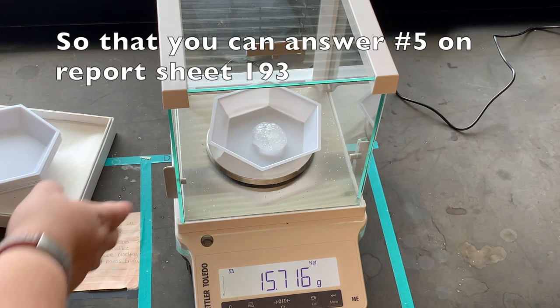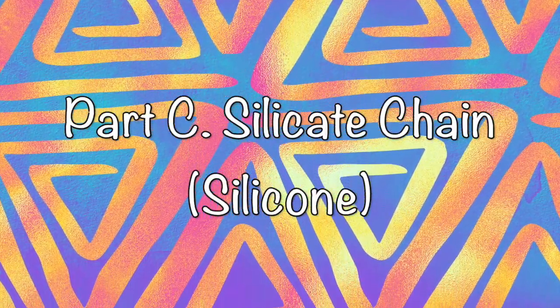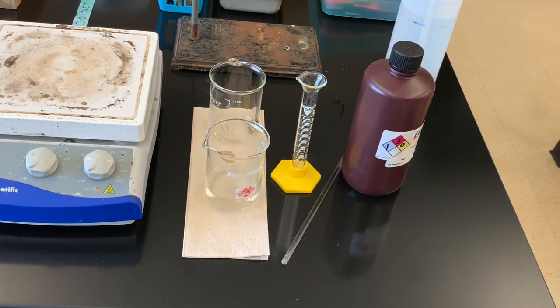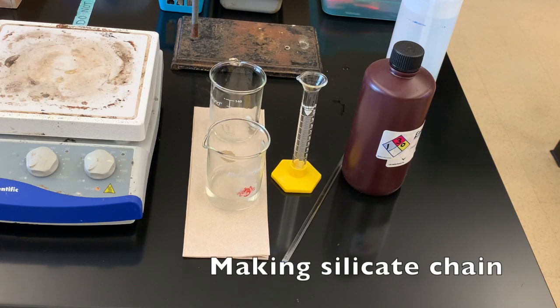I'm going to leave it in the weigh boat and we'll come back to see what happens in a few minutes while we do Part C. I have my water glass cooled. Part C uses the water glass we made in Part A. In Part C, we are making a silicate chain, or silicone. We've let that cool to about room temperature.